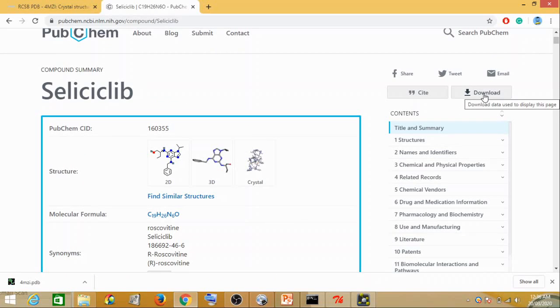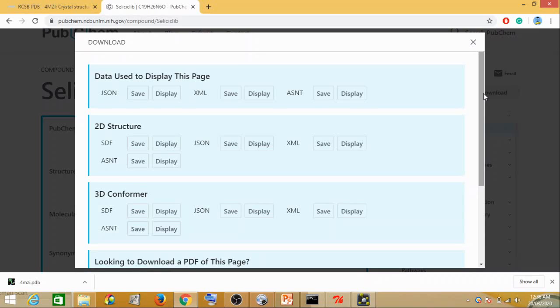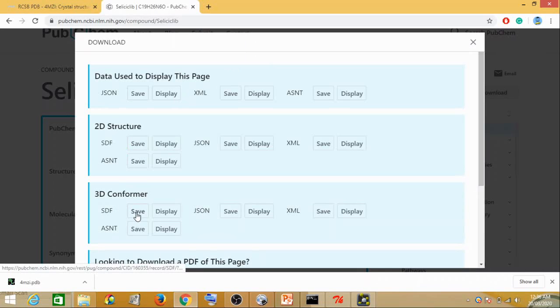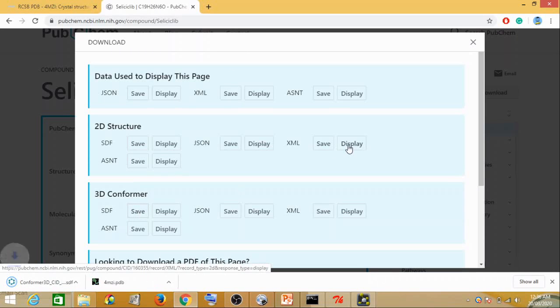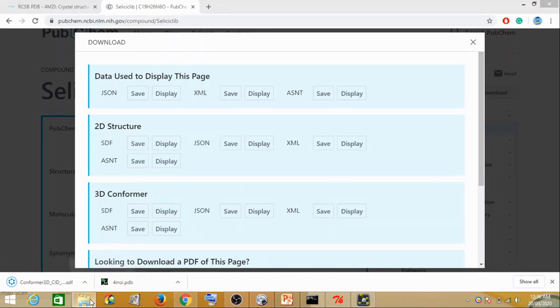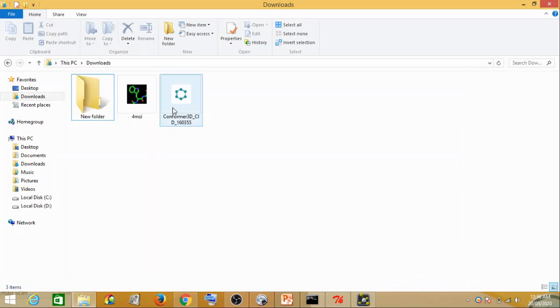You go to downloads and click on this. Here you have a 2D structure and 3D structure. We can save the SDF format for the 3D conformation. Click on save. So we have the protein and the ligand ready.